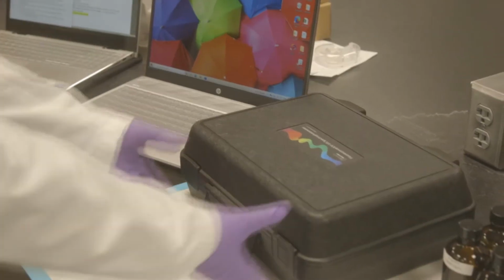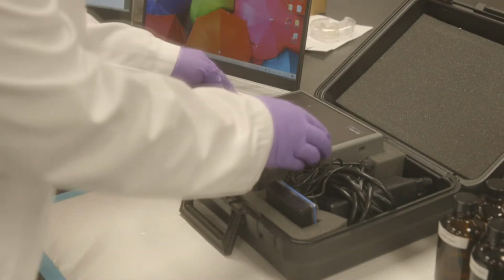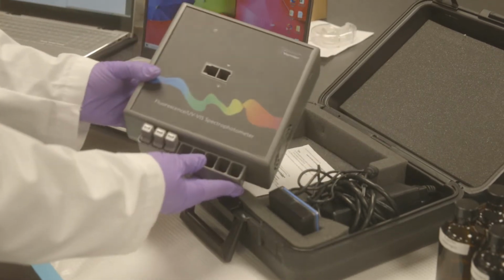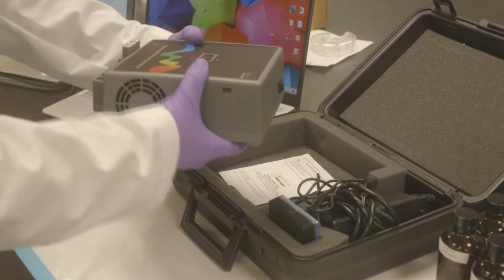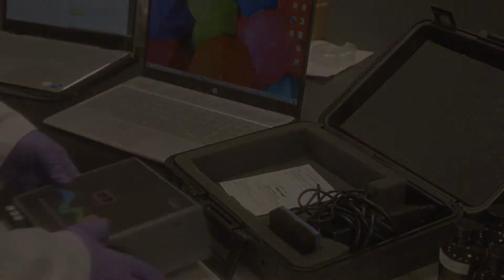In this lab, you will measure the salicylate concentration in forensic cases using UV-visible spectroscopy. The fluorescence UV-Vis spectrophotometer measures the absorbance and fluorescence spectra of various chemical and biochemical compounds.